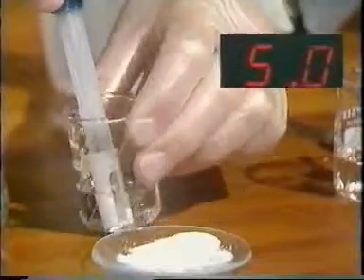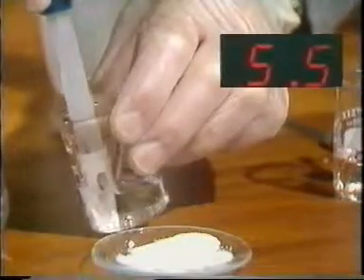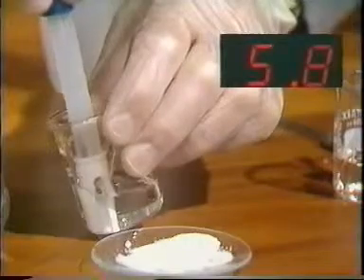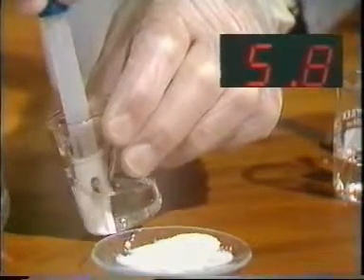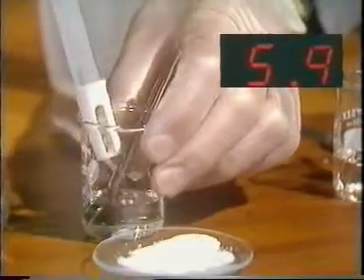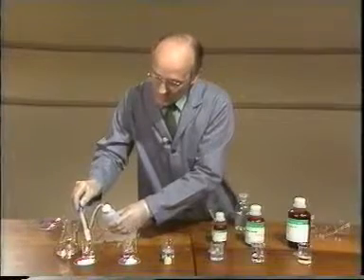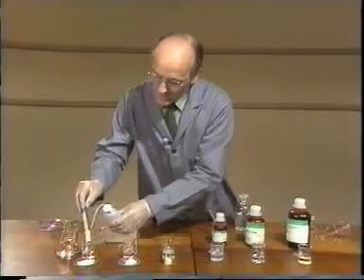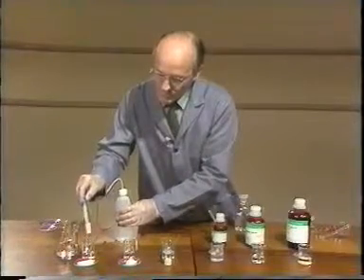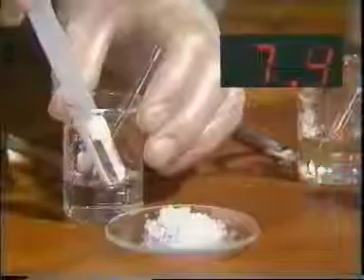Now, sodium chloride. When it settles down, a pH of 5.8 or 5.9, which is much the same as the pH of the water that we're using, due to the absorption of some carbon dioxide from the air. Rinse the probe carefully before trying the next one.